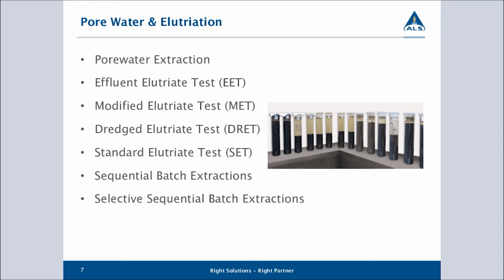We traditionally use an EPA Region 10 Army Corps of Engineers protocol. Again, manipulation of these samples is performed in the glove box. These are sealed up with an anaerobic headspace, double centrifuged in refrigerated centrifuges, and then we're able to put those back in the glove box and take off the pore waters.